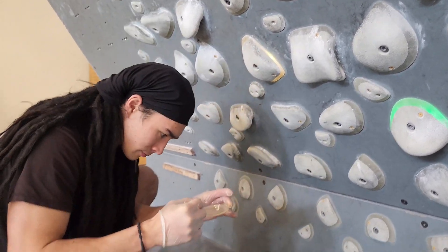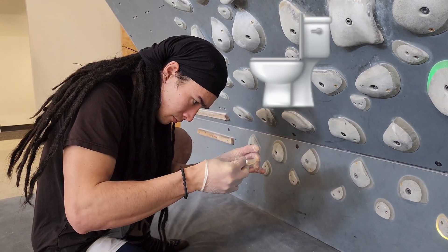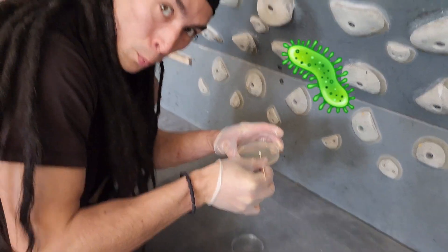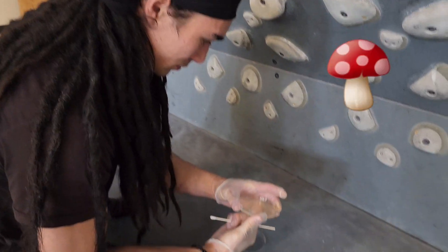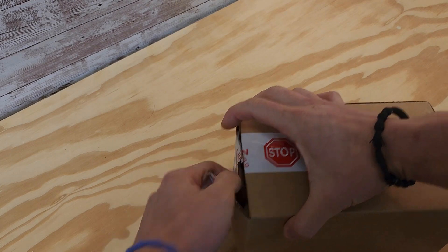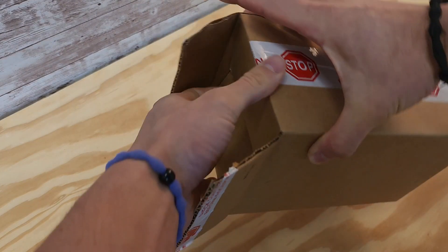While I'm at it I might as well swab a toilet and swab some of the gym equipment to see if there's anything like bacteria, germs, fungus, or mold growing on those pieces of equipment. I keep seeing stuff like this where there are handprints right next to footprints and it kind of grosses me out sometimes, so I got neurotic and ordered petri dishes and swabs off of Amazon.